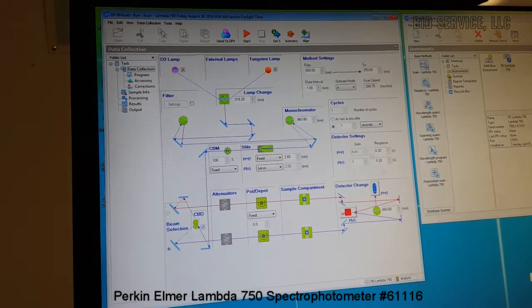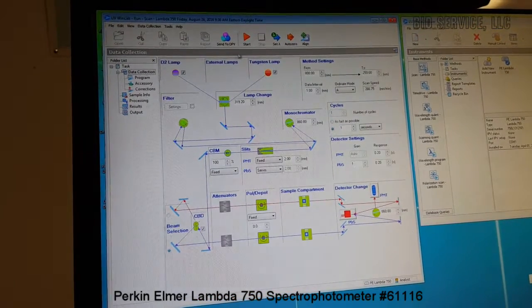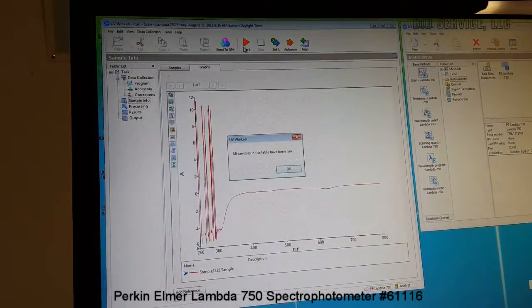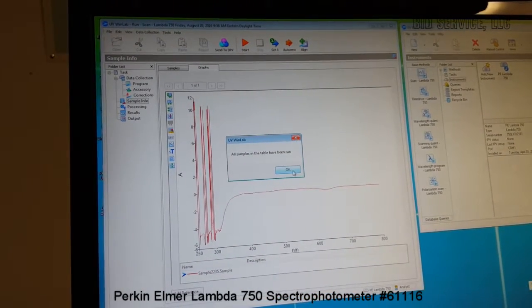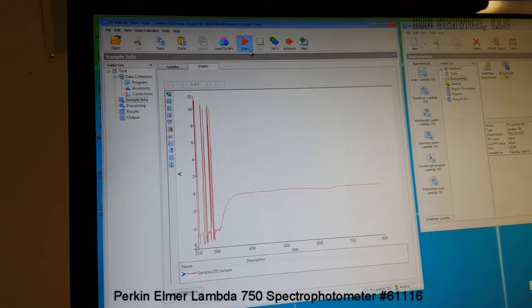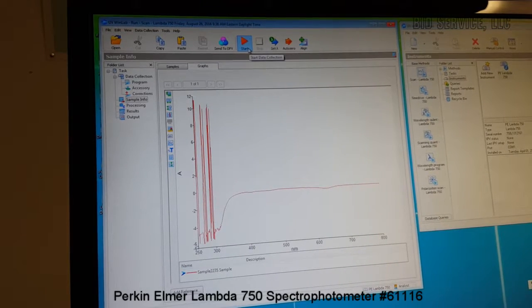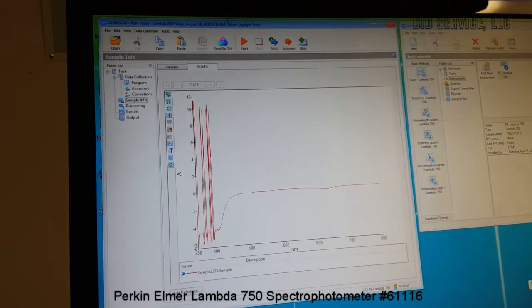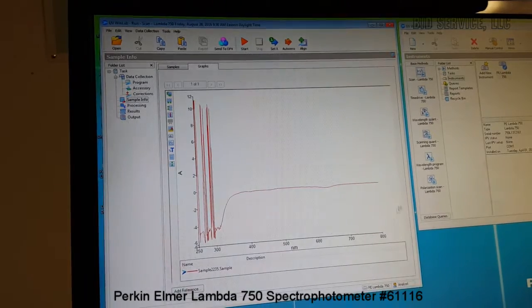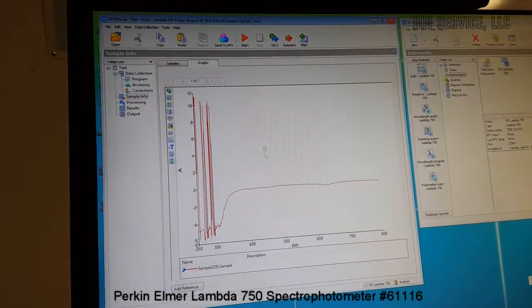Once the selection is over, we can press start. So once we start, the system will start a scan and will display a plot.